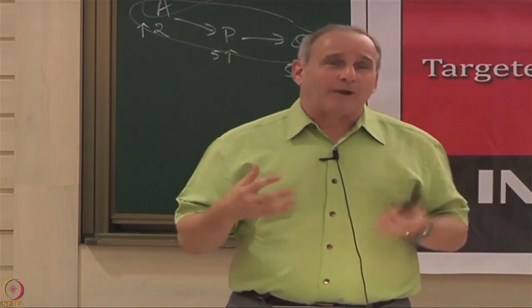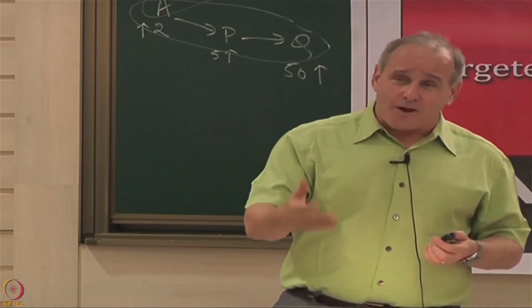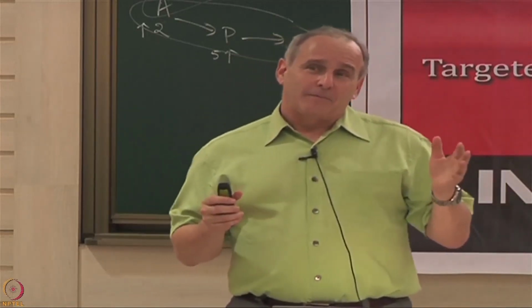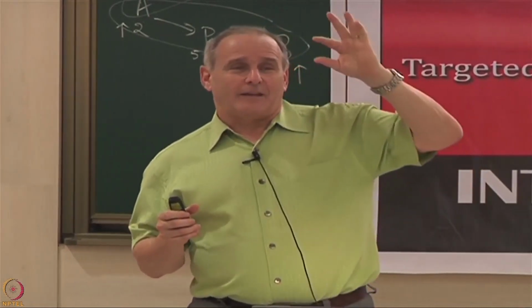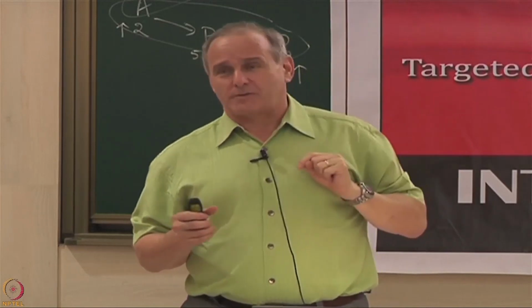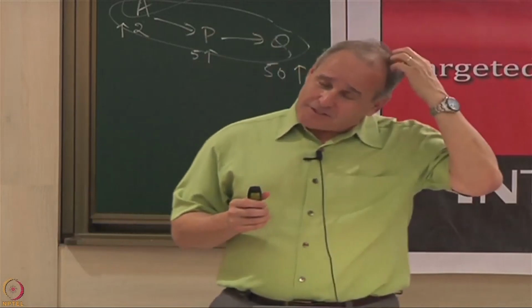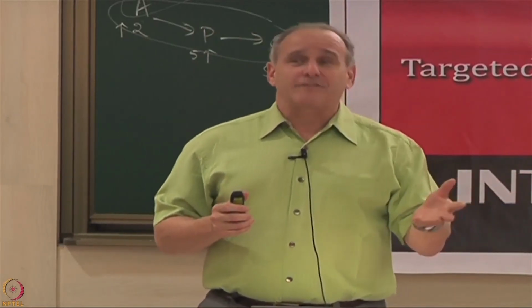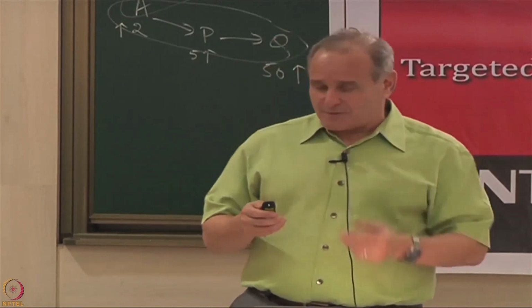I was racking my brain, how can I do this inexpensively? And so it was for that reason that we decided to try the multiplex NAPA, okay? Because that way we could get the entire proteome of TB in 1/4 of an array. In fact, one array would be able to do 4 proteomes at once, okay? So that really lowered the cost. And of course, the other problem, besides the lack of money, was that we were almost out of serum. So we had very little serum to test, and of course, we needed that to do the study.